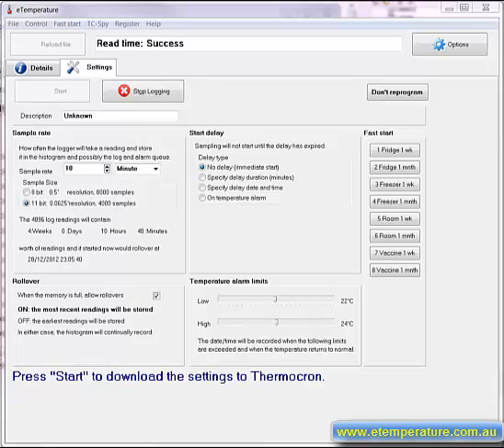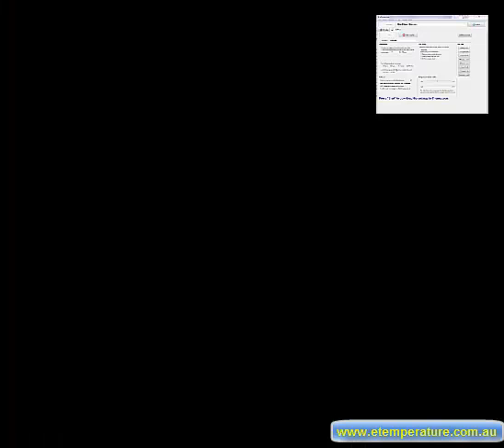This unit is a TCS which has the option for 8 or 11 bit samples. 11 bit samples are better and should be used. This gives 4000 readings in memory. The TC model has 2000 readings.